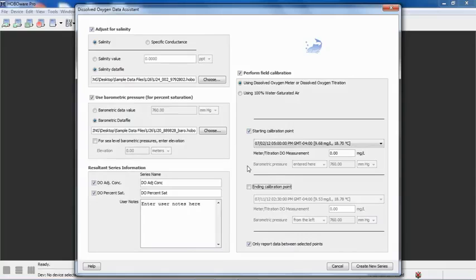However, keep in mind that if you do that, you're just using one fixed value. Again, the series will be adjusted for one calibration point. So it may be accurate enough for applications where there is no significant fouling, but if you're going to do it, it would make sense to use both, or at least an ending calibration point, so that you can effectively compensate for or correct for changes in the measurement due to fouling.